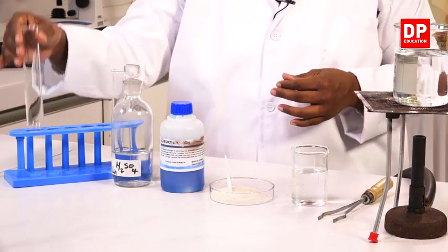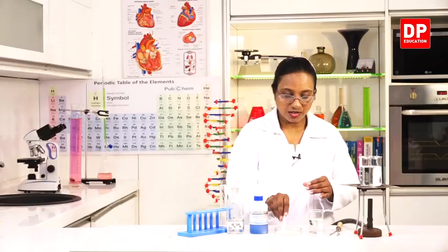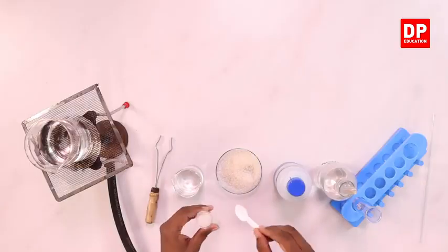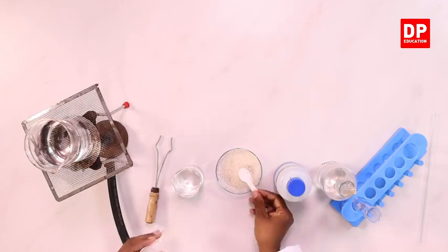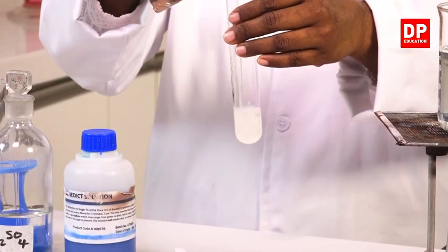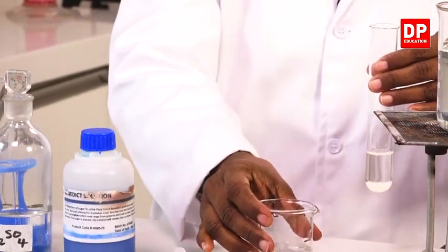First, I will prepare a solution of sucrose by taking a small amount of sugar into the boiling tube and adding little amount of water. As you know, students, sugar can dissolve very well in water. So if I mix it nicely, you will get a proper solution.